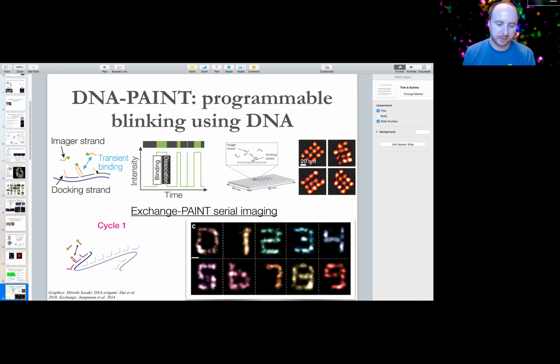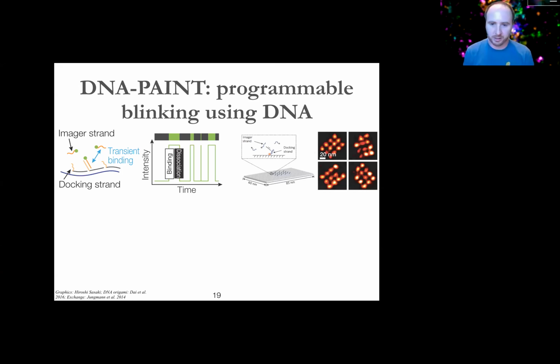And this will last for about a second or so in the way we've programmed it, then it'll just spontaneously dissociate. So in the diffraction limited field where this target is located, if you look at the intensity trace in time, you basically get these blinking events where it blinks on, it stays, it dissociates, and then this happens again and again and again. And this is what allows us to get single molecule blinks that we can then super resolve.